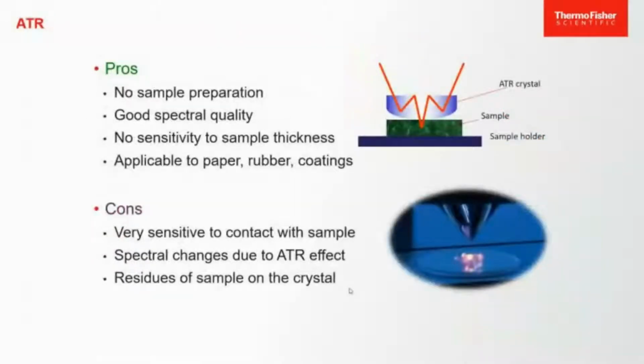ATR, as I've said multiple times, is probably the favorite of many people because you don't have to prepare anything on your sample. You just take the crystal, you make sure it's good and aligned, and then you get it in touch with your sample. The spectral quality can be excellent, as you'll see during the presentation.